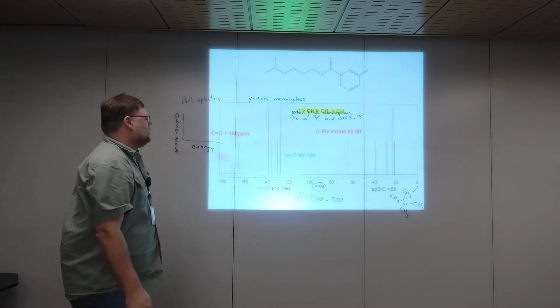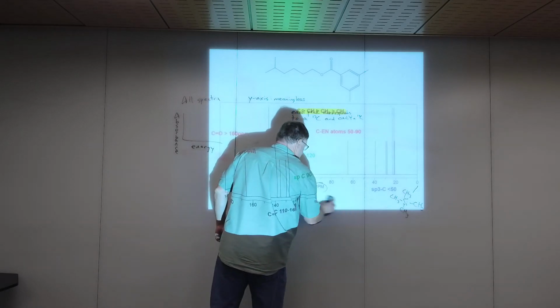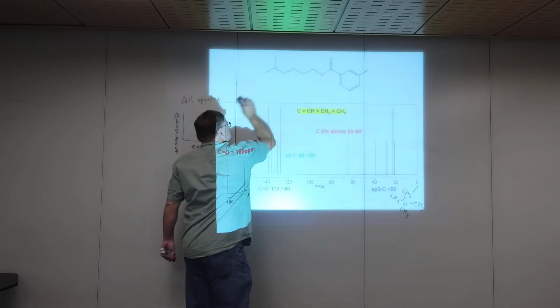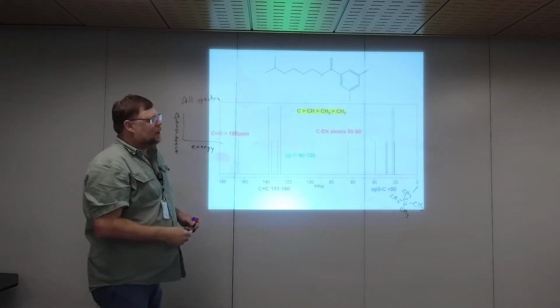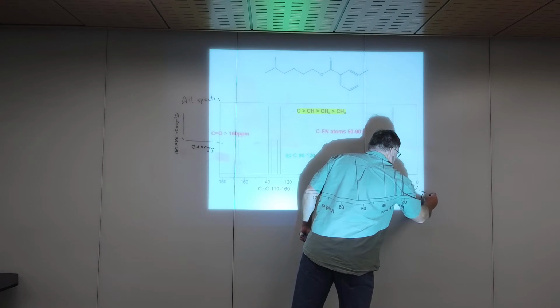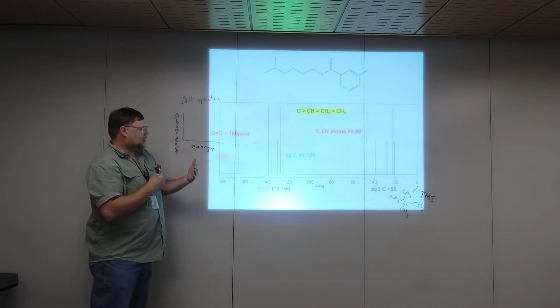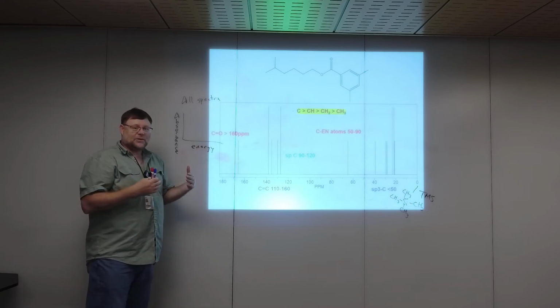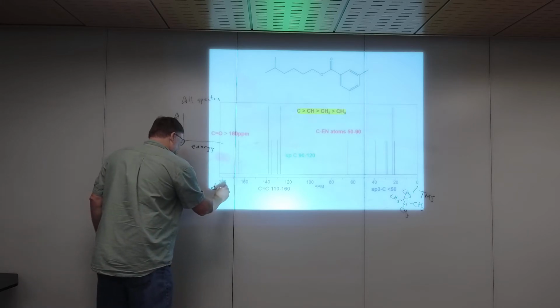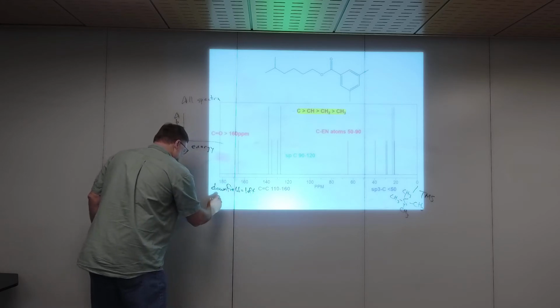Next thing. So here we go. I'm going to erase some stuff. I'll leave TMS down there. So this molecule is called TMS. You might see it in the book that way. As you look, the less electron density there is around a carbon, the farther downfield it will come. So a couple of terms here. Downfield in NMR is to the left. De-shielded.